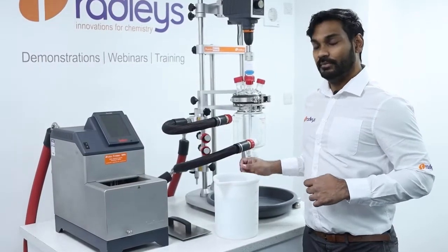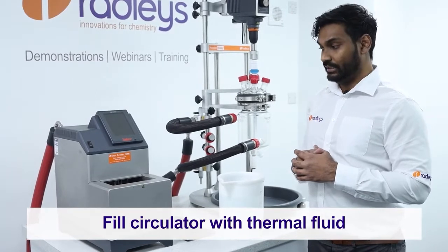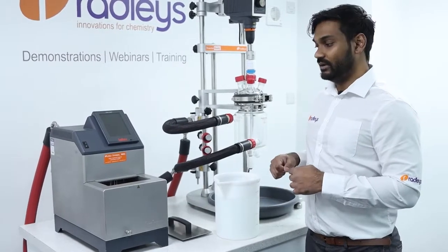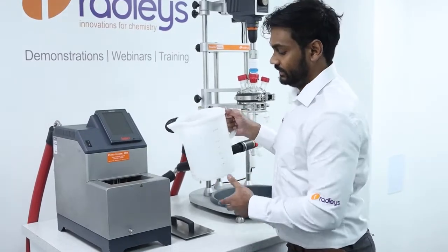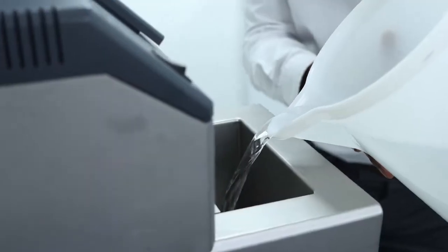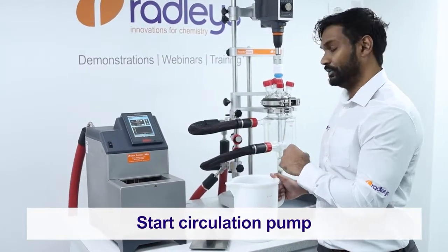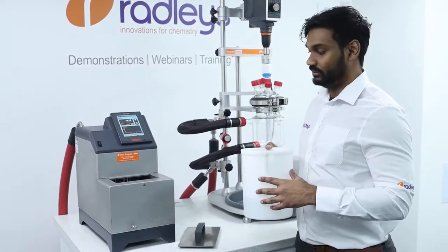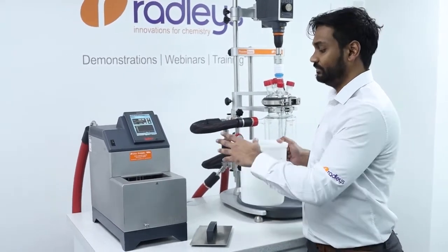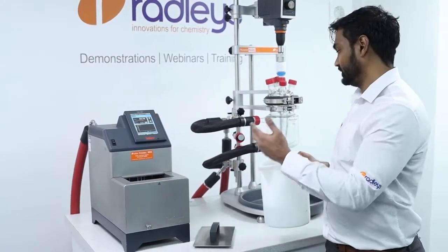We then attach our hoses onto the adapters on our reactor ready manifolds. Now that we've got everything connected up, we can start filling our circulator with thermal fluid. As we're using a MiniStat, all I have to do is simply pour the thermal fluid into the bath. Now we can start the circulation of our thermal fluid around the jacket. Make sure you have another jug of thermal fluid to hand so that you can keep topping up the bath as the liquid level drops while it fills the jacket.